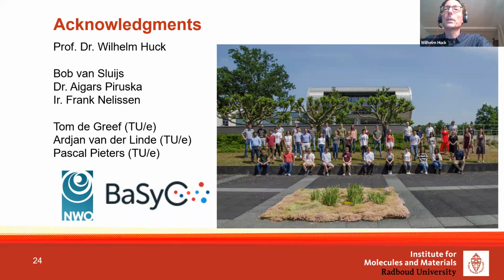Thank you. Let's see. There's a quick question from Brendan Mortega, who already had a question, but this is a quick one, I think. Great talk. Do you need microfluidics, or would similar work be possible in other compartments like vesicles or GUVs?